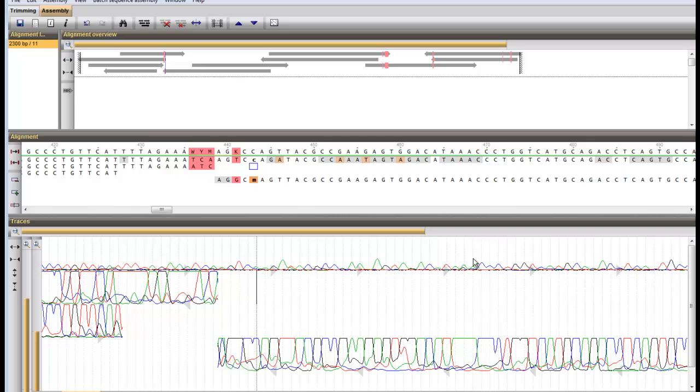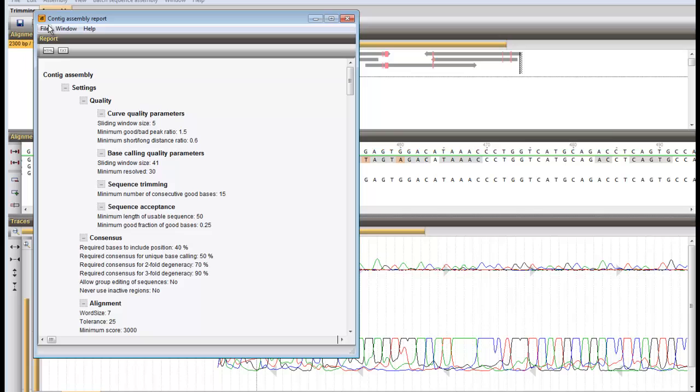All technical information on the settings used to achieve this contig project can be viewed in the assembly report. The settings used in this project can be saved in a template for later use.